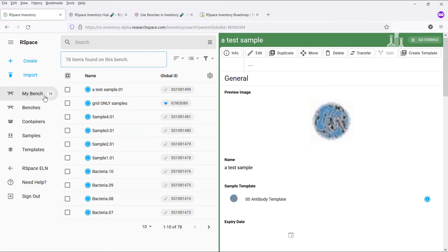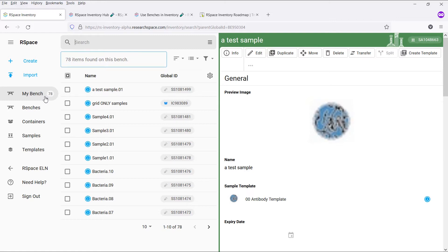Benches make it easier for you to quickly access these items from a single location when using Inventory, and also help you and your colleagues find who has checked out an item, if you find that the item is missing from its usual location.